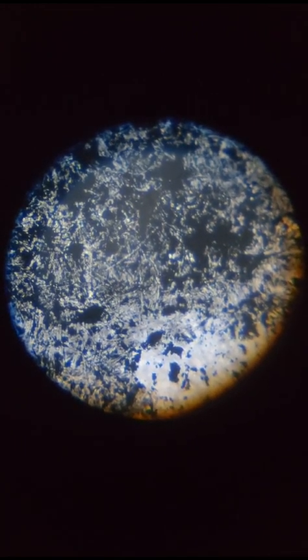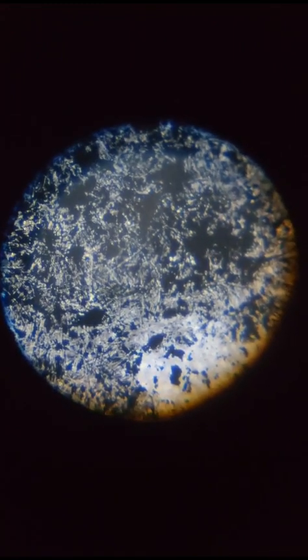This is the size. Now we will be changing it to 200 times. 100 times. We have changed to 100 times. How does this look in the microscope? We are using a super cool vision from this, remember in your mind, to this. How does it look? Now we'll be changing. You can pause this video and see from this.